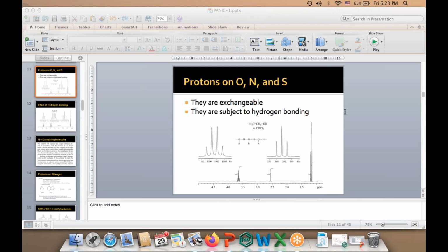Sir, I want to ask how we choose the base peak in NMR spectra, as we use TMS as the reference peak. Okay, so once you use TMS as a reference peak, it really depends what kind of solvent you have for your NMR, right?